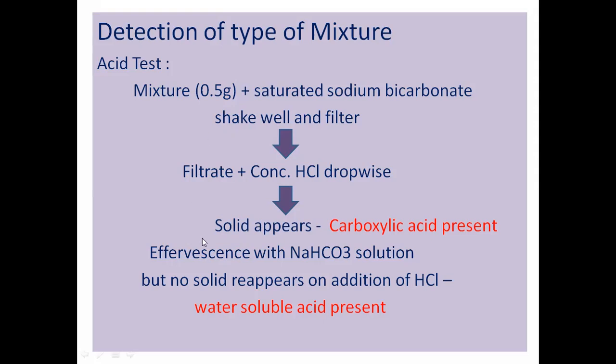Now, the second possibility is there. When you take this mixture, add all this, shake well, filter, filtrate plus concentrated HCl. After adding concentrated HCl in the filtrate, you get effervescence with the NaHCO3 solution, but no solid reappears on addition of concentrated HCl, then a water soluble acid is present. If a water insoluble acid is there, you will get solid here. And if you have a water soluble acid, then you will only get the effervescence. You will not get the solid after addition of HCl.